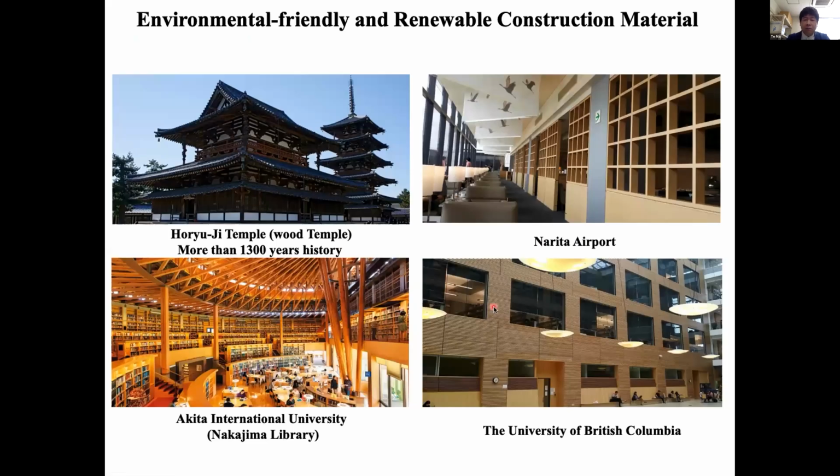I'm going to talk about the application properties of using the NIR imaging method to monitor the water content in wood during the drying process. As you know, wood has been used for thousands of years because it has substantial benefits over other building materials. It is naturally renewable and helps to fight climate change through carbon storage.